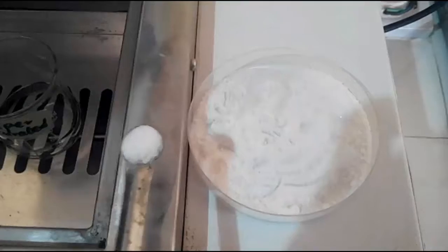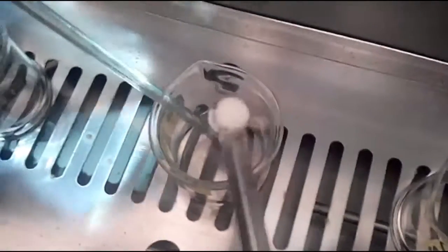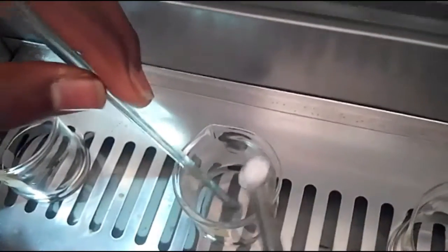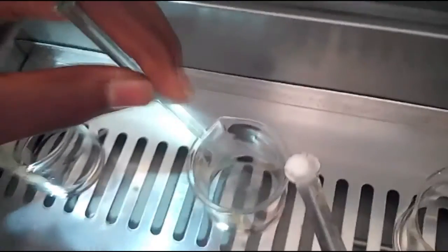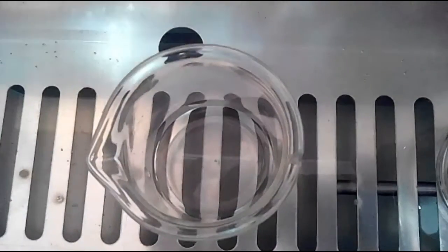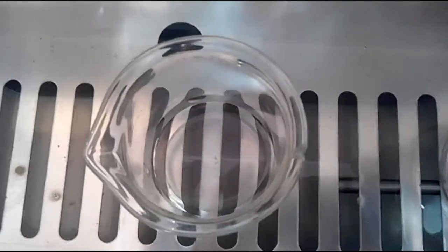Once again, the salt totally dissolves. You add salt little by little till the water no longer dissolves the salt. Here we have obtained our saturated solution because the water no longer dissolves the salt.